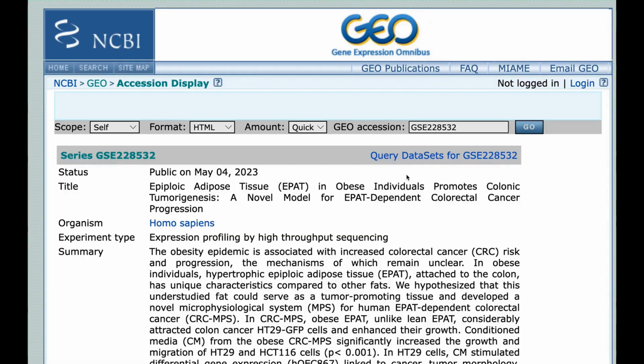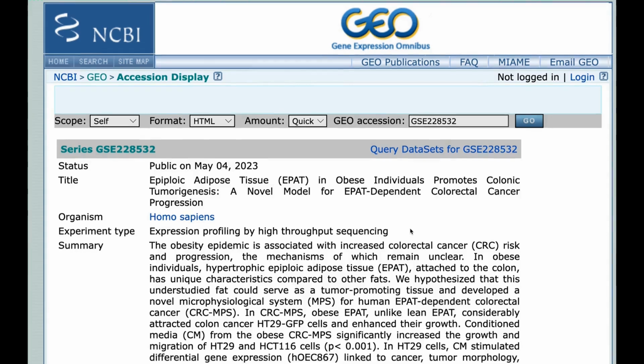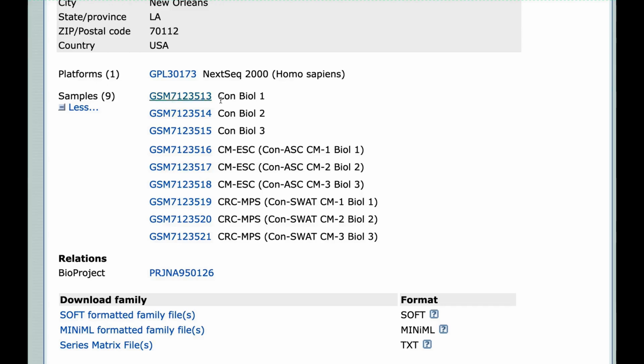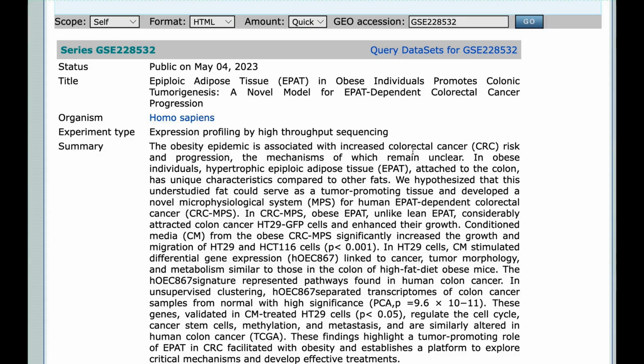Working with a single differentially expressed gene is not very handy, especially if you want to demonstrate figures. Therefore, I took another data set for today. It's another RNA-seq data, which also has a DESeq2 button. As you can see, it has 3 groups, 2 cell line controls and 1 cell line treated with some stuff. Details you can read further if you're interested in obesity and adipose tissue. But for us it is important to check the script and illustrations to it.